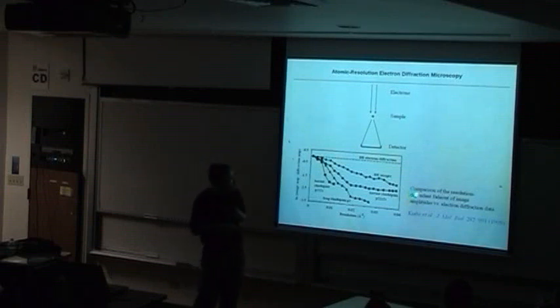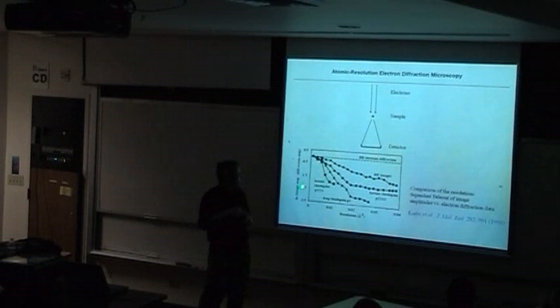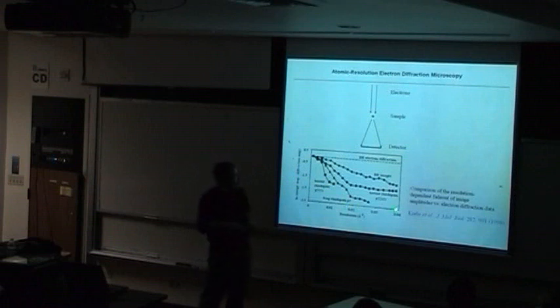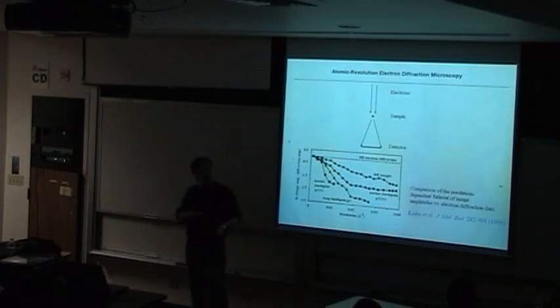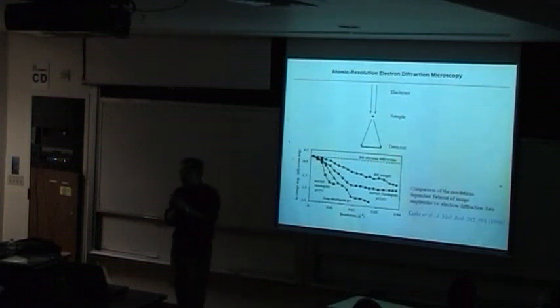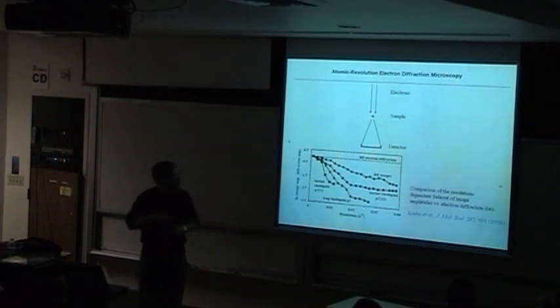If you just study biological samples, this was actually studied by somebody else. This paper showed bacteriorhodopsin 2D crystals. You get a diffraction pattern versus an image. If you plot them on the same logarithmic scale, you will find that at high resolution, the diffraction gives you more information. The lens is good, but at high resolution, the lens always has problems. They do improve the lens, of course, but still, if you can get a perfect reconstruction, the diffraction still gives you the most information, right?